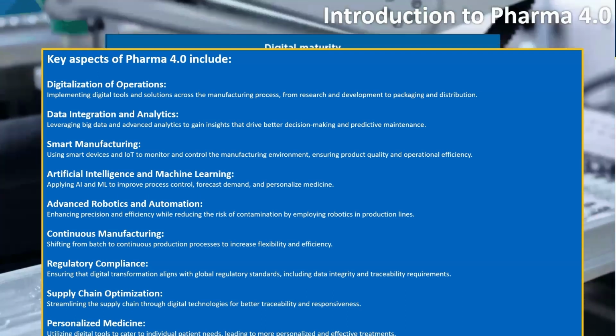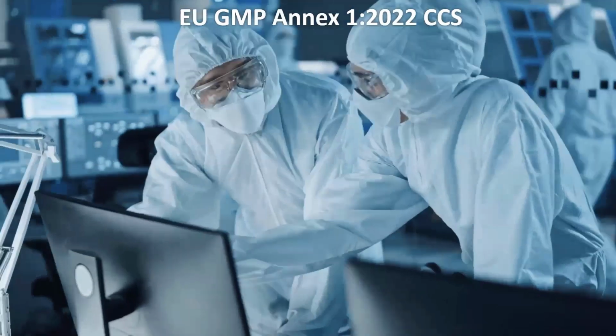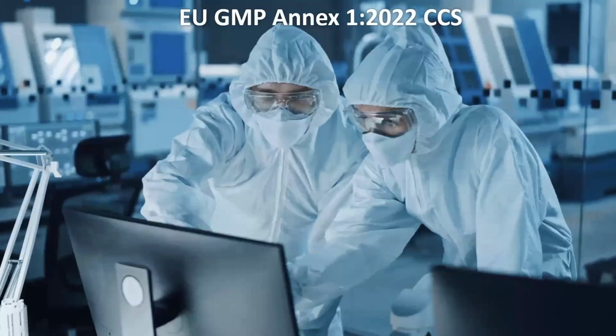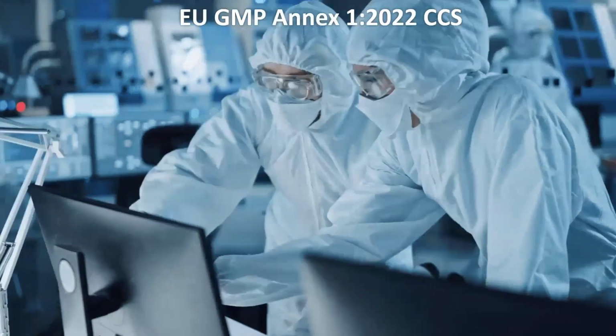So these are some of the aspects of Pharma 4.0. Now we get back and look at EU GMP and the latest revision. It's testament to the evolving landscape of aseptic processing, and it brings forward stringent requirements for environmental monitoring, aiming to safeguard the manufacturing of the sterile products.